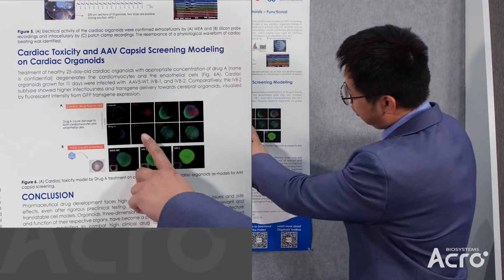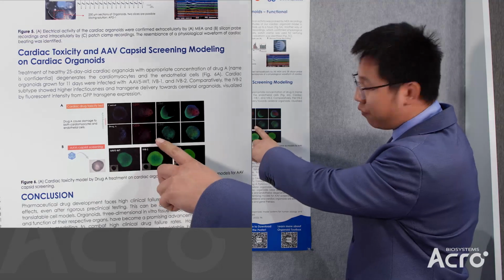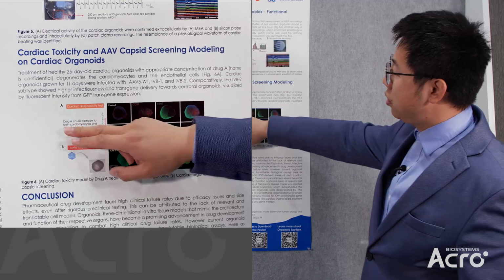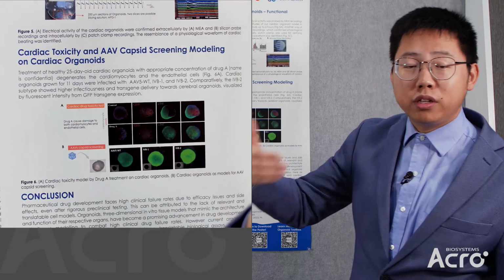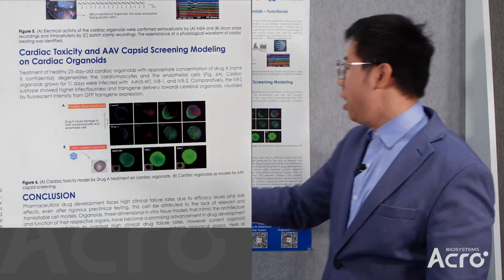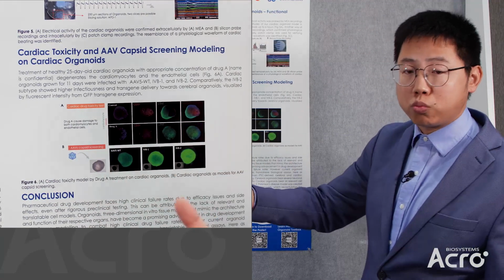With the introduced drug, you can clearly see the fluorescent intensity is significantly lower than in the control panels. So that means this drug at a specific dose is harmful to the human heart. And also this could be used to do drug screening.